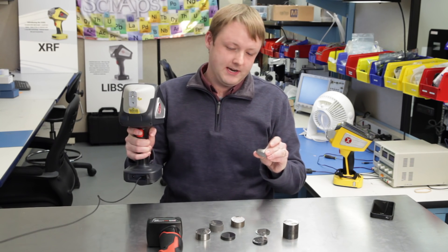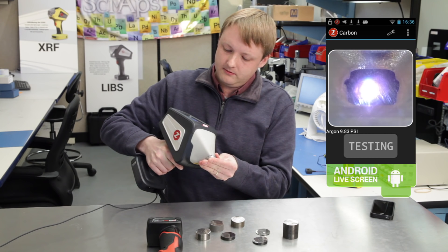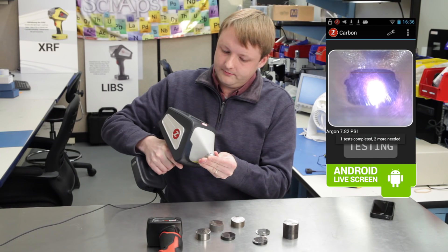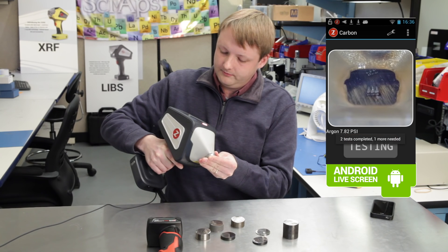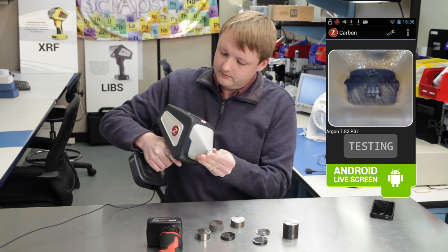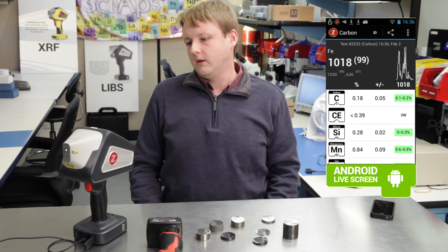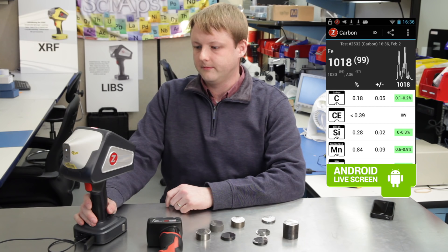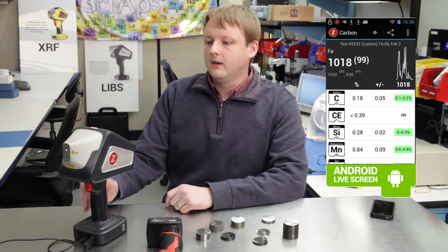I have a 1018 that actually has 0.17% carbon in it, so we'll shoot this a few times and see what we get for a carbon result. That's a perfect match — 0.18 carbon, just like a 1018. We're also showing carbon equivalence in the software, which is also unique. Nobody does that with a handheld either.